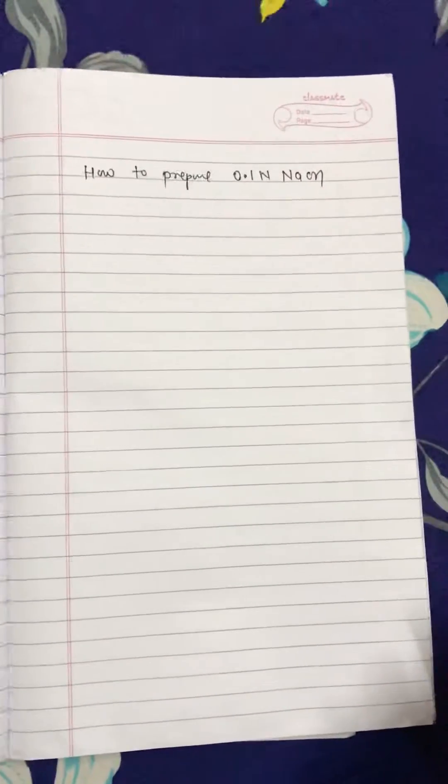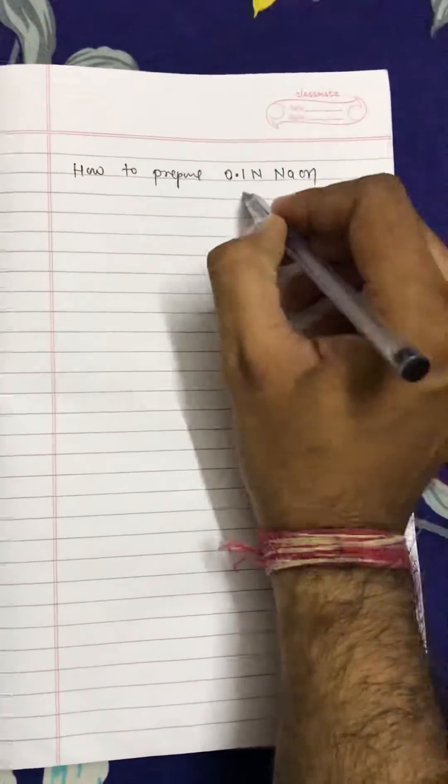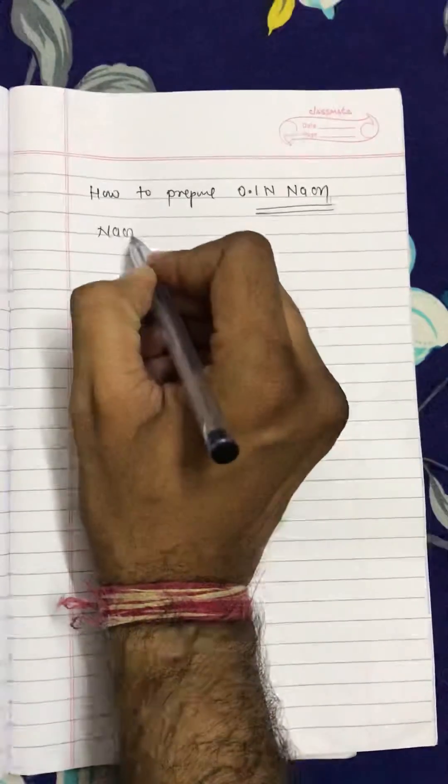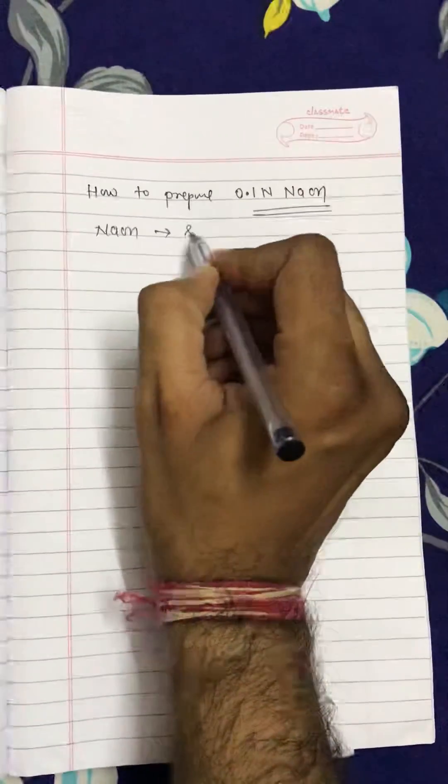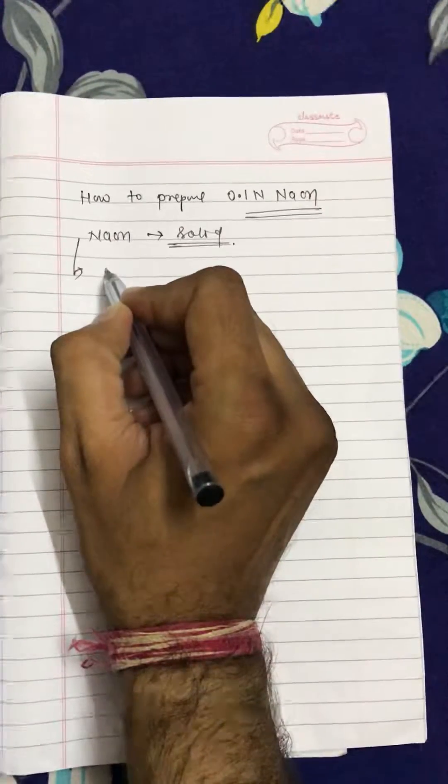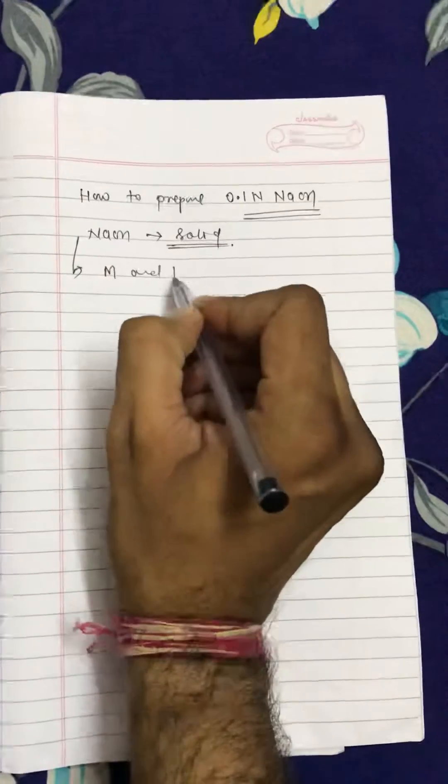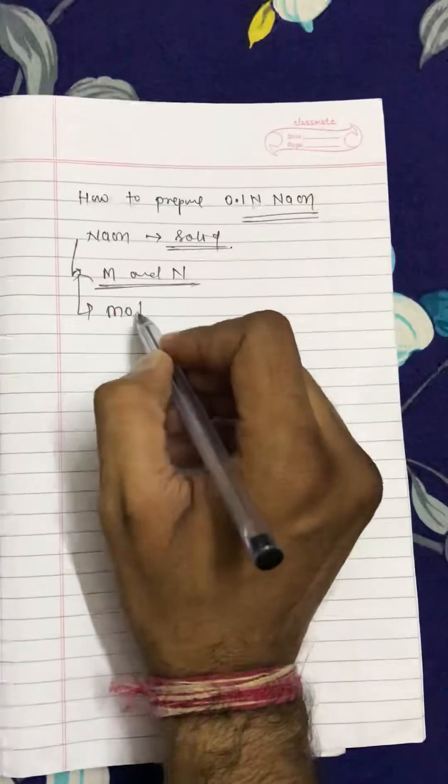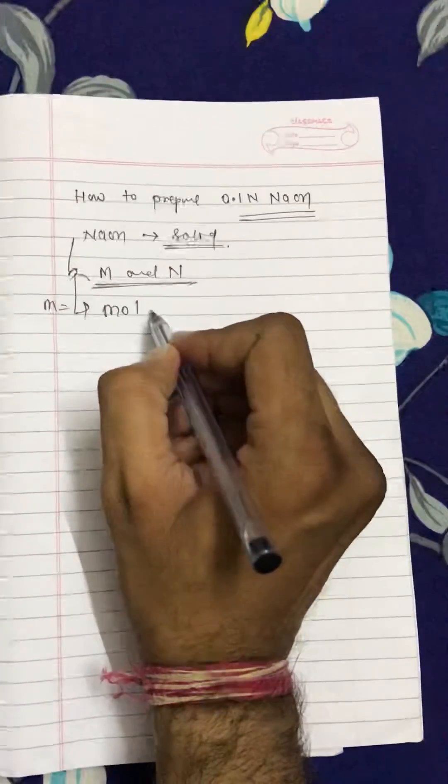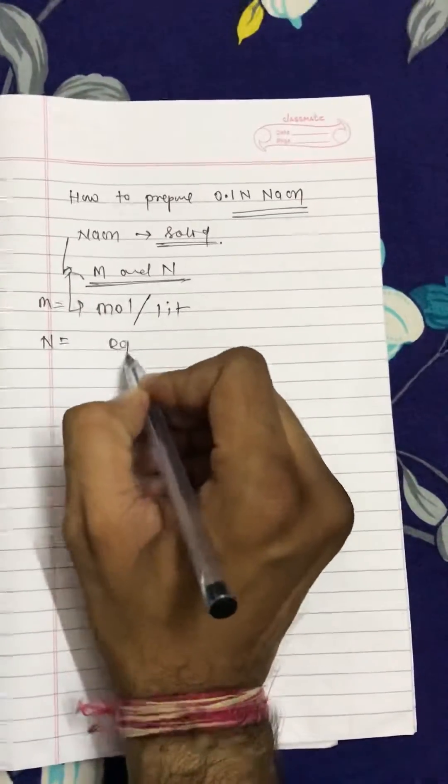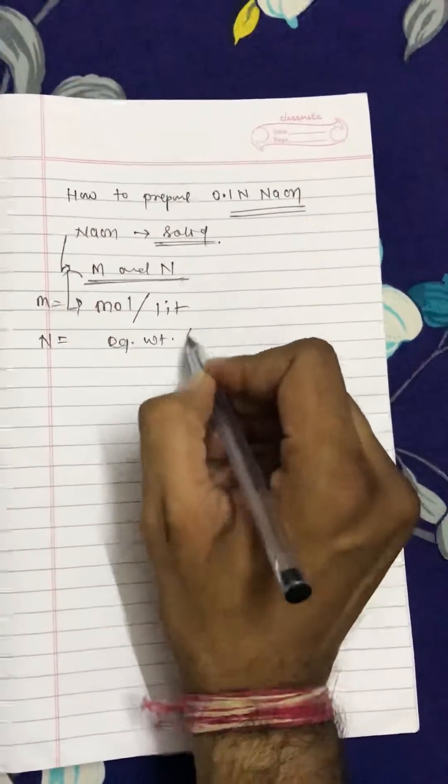Hello everyone, today we are discussing how to prepare 0.1 normal NaOH. As we know, NaOH is present in solid form. Molarity is moles per liter, and normality is equivalent weight per liter.